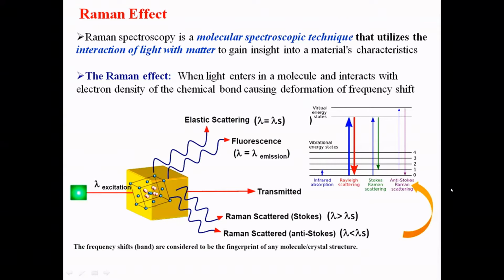Sir C.V. Raman was highly interested in the scattering phenomena. So the whole idea deals with the scattering alone. We are not interested in the other processes like transmission, reflectance, and absorption, because he thought that the scattered light has information about the structure or molecular environment. So that has a fingerprint identity.